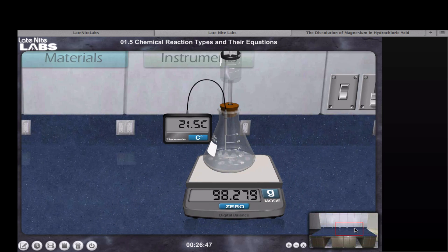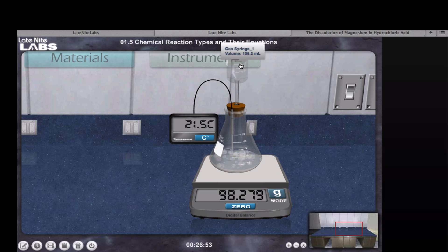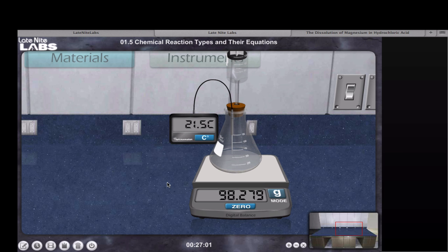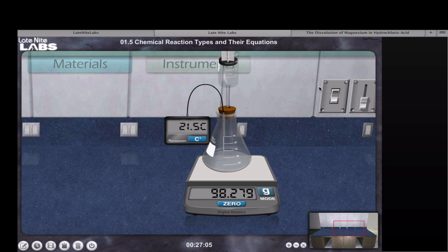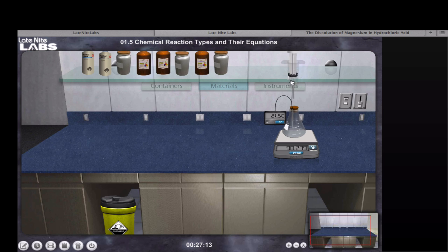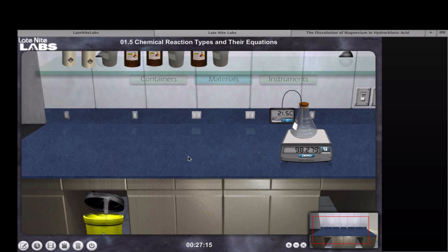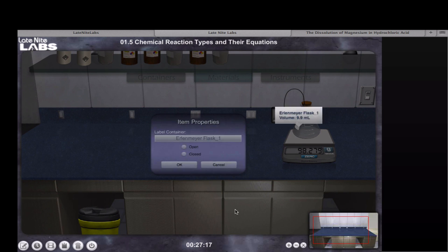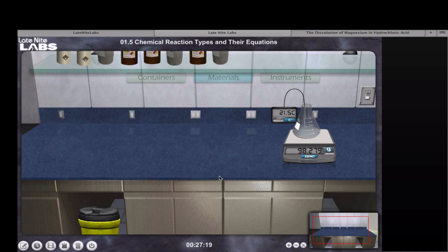We can see immediately that bubbles are forming within the reaction solution, and some gas has been evolved, because we can note the increase in volume to the overall system. The temperature went up slightly, but has already returned back to roughly room temperature. Note that the mass is still the same, because the system was completely closed. If we remove the syringe and open the system, the gas can escape, and we can attribute that lost mass to the gas that was evolved during the reaction.